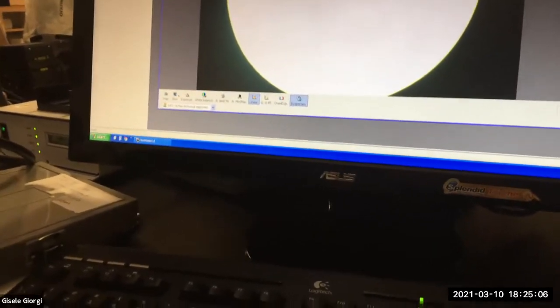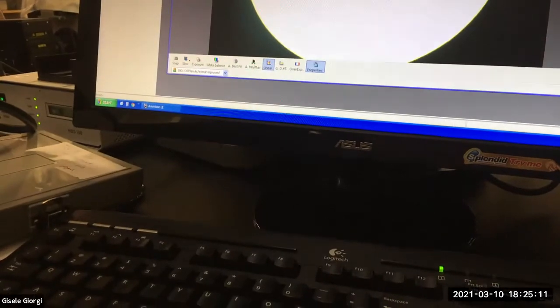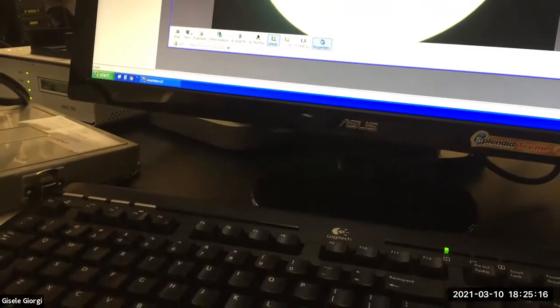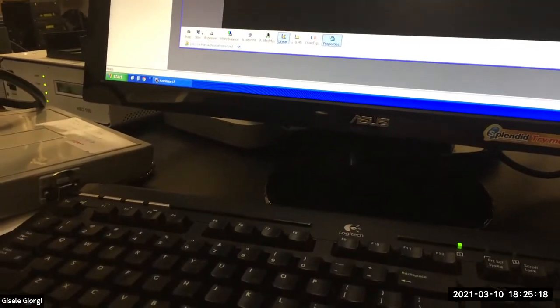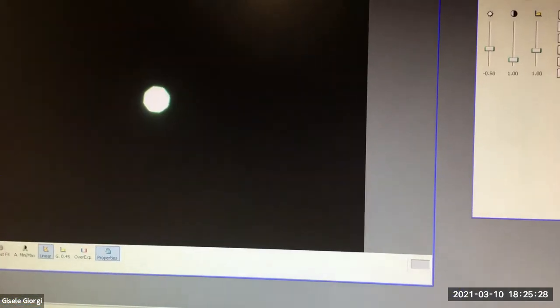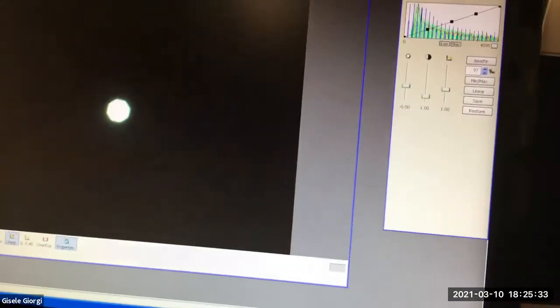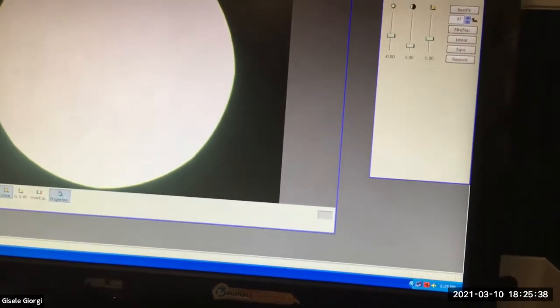Now, I find it interesting that a lot of microscopy how-tos will tell you to center it while it's still closed down. So you can see that it's not an actual circle because it's nicely in focus again. There's a lot of people who will center it when it looks like this. There's absolutely no reason to do that. I don't know why people do that. You can open it up and say, here's the only reason.